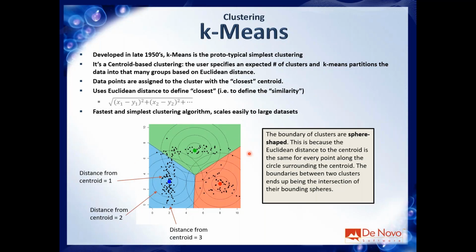If you look at this example, those are the centers of each cluster. So basically what we want to do is to calculate the distance between each dot and the centroid, and then assign the dots to the closest centroid. So this dot is closer to this one, so it will be green. This dot is closest to the blue one, so it will be blue.